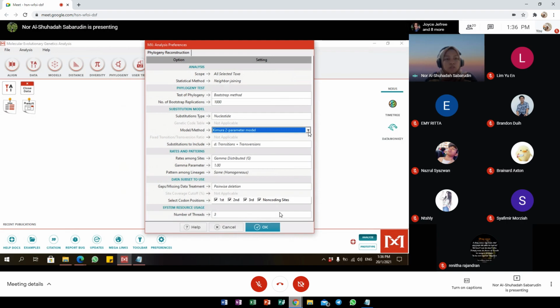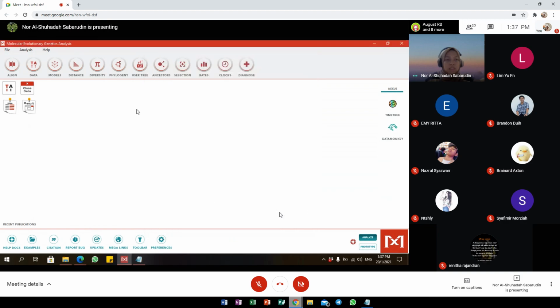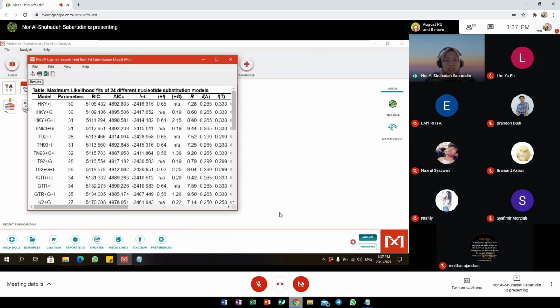In my case right now, the first one is HKY plus I. HKY is Hasegawa Kishino Yano, so I need to choose Hasegawa Kishino Yano. However, in this option, there is no Hasegawa Kishino Yano. So I will choose cancel first and look at the table again.